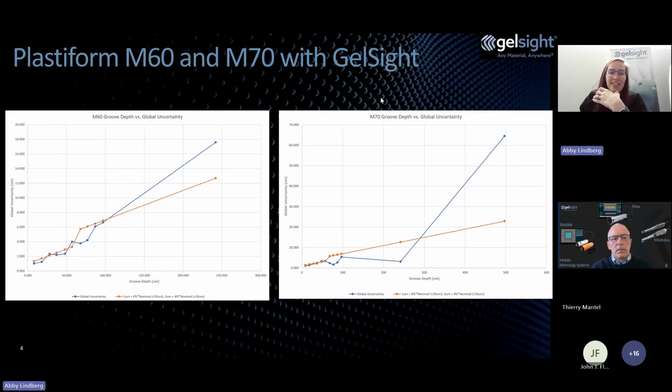So you'll see that the threshold for when that change happens is different based on the durometer of the replica material. There are plenty of times where we see some putties or replicas in the field where they might be too soft for the GelSight system. So that's just something to keep in mind if we're using replica with GelSight.